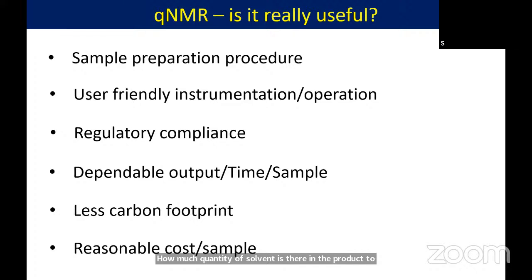So all these are problems which earlier they used to handle with many other techniques. Some of them, like solvent impurity, cannot be done using a single analytical technique. Solvent can be evaluated with GC, and then the sample can be evaluated by using HPLC. Multiple techniques are to be used. So there are so many complicated issues coming where qNMR is offering a lot of hope.